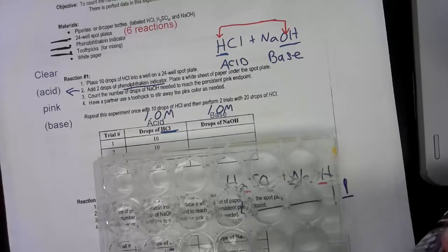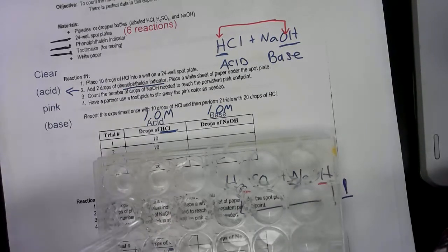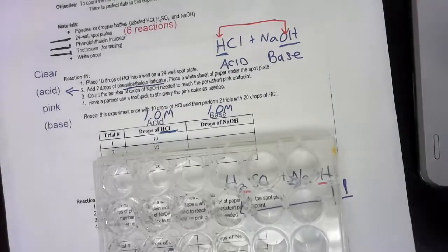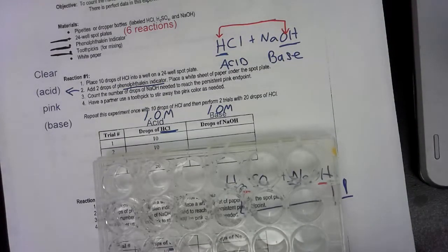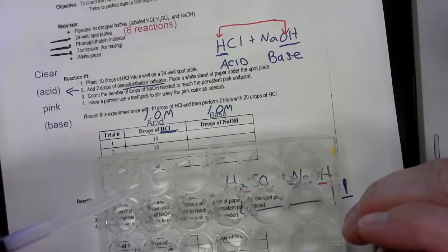So it's really important, like you see here, trying to put equal drops. So this is 1, 2, 3, 4, 5, 6, 7, 8, 9, 10. And then we put in 11, 12, 13, 14, 15, 16, 17, 18, 19, 20, hoping that all my drops are good. Okay. Then we're going to put an indicator, and it says 2 drops, but I think only 1 is necessary just because I don't want to waste it and I don't want to make it too crazy. So I put 1 drop of the indicator in each.